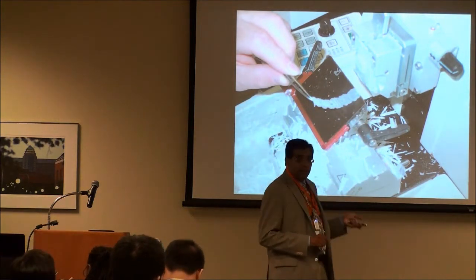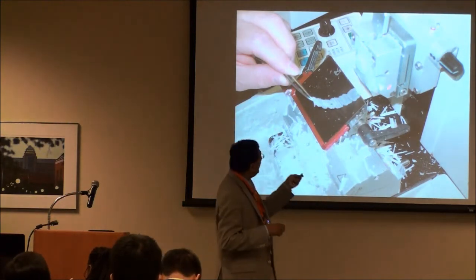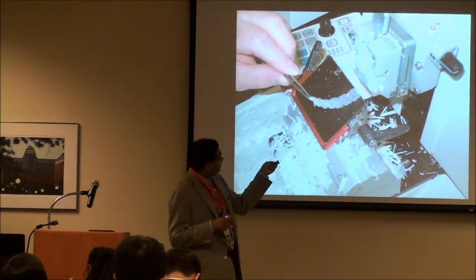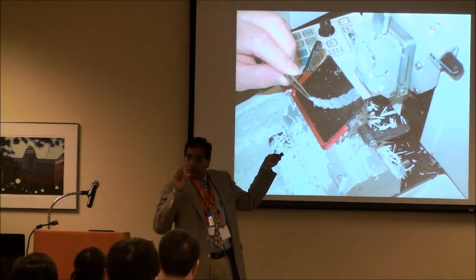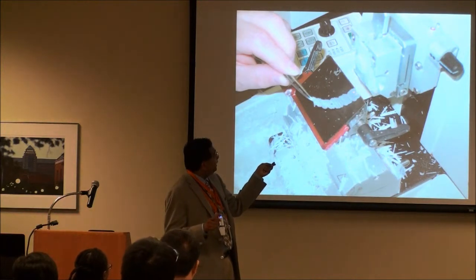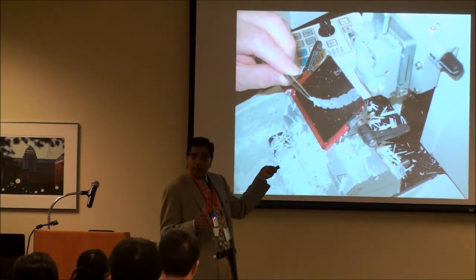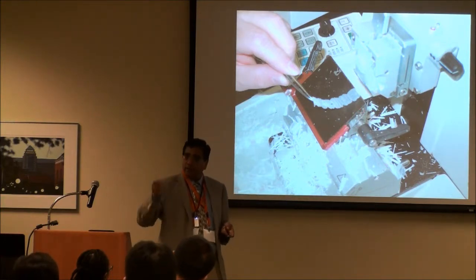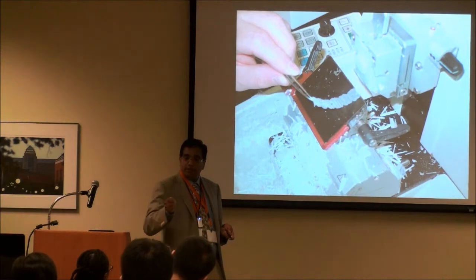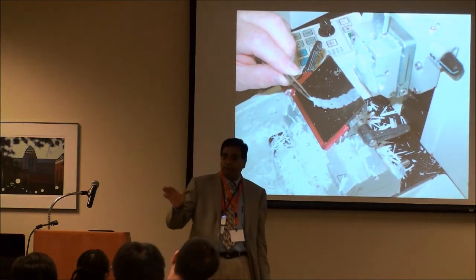After the sections are made and H&E stains are done, we only look at 3 microns. See this tissue here? There's a lot of tissue that's pending in the block. If I'm able to make a diagnosis based upon this ribbon of tissue on H&E, then we save the slide, I dictate my diagnosis, and this paraffin block gets saved.